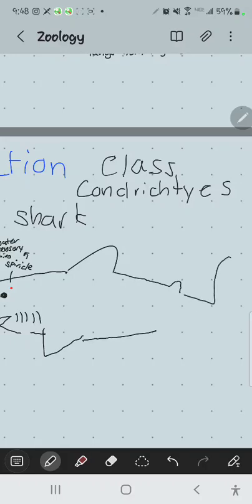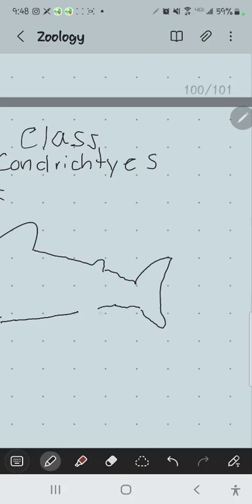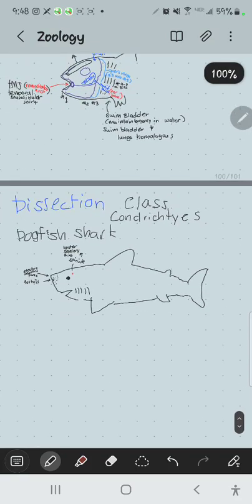So take a look at those. Take your thumbs, like you'd be squeezing a blackhead, and squeeze their nose, and this gelatin stuff comes out. That gelatin is like an electroconductive jelly for their voltage. Obviously, they have the jaws, etc. Okay, so one other thing I want you to check out here is that sharks have what's called a lateral line system.